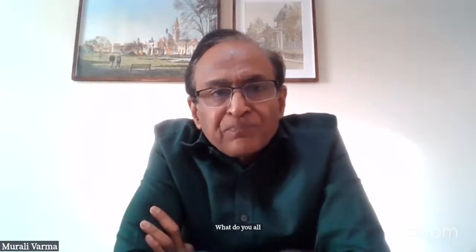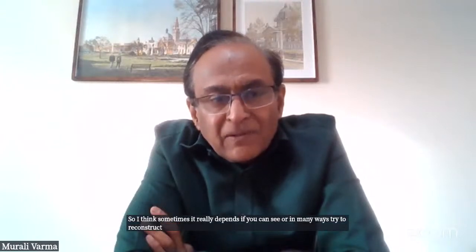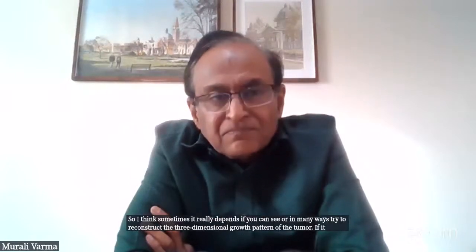So I think sometimes it really depends if you can see, or in many ways try to reconstruct, the three-dimensional growth pattern of the tumor. If it's very close or connected to the main tumor mass and bulging towards the fat and is encapsulated, then I don't call it.